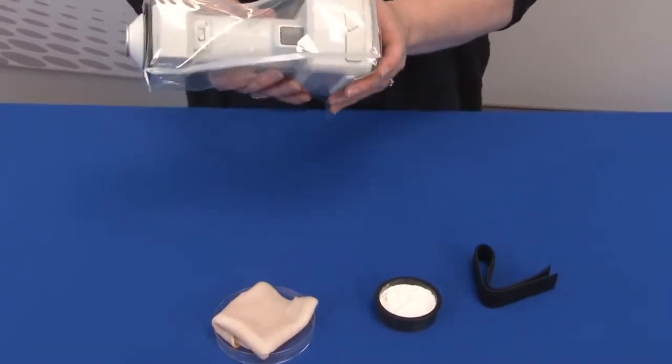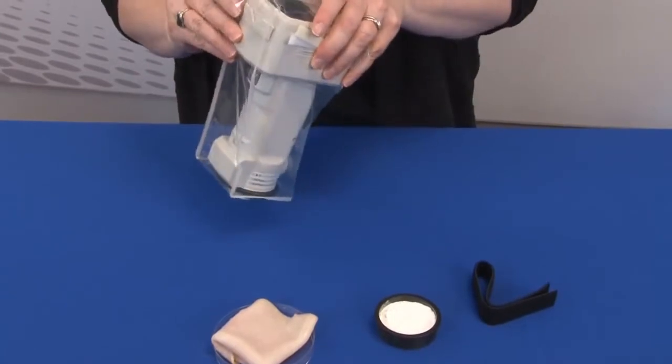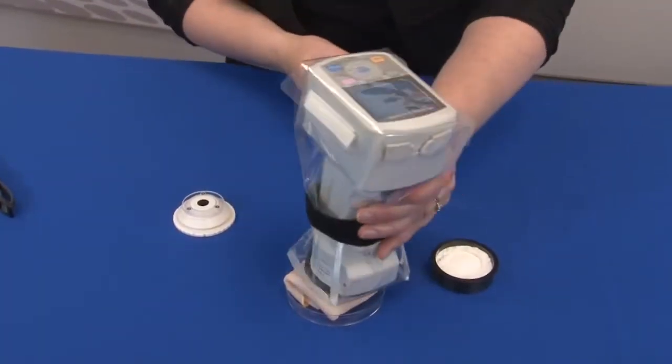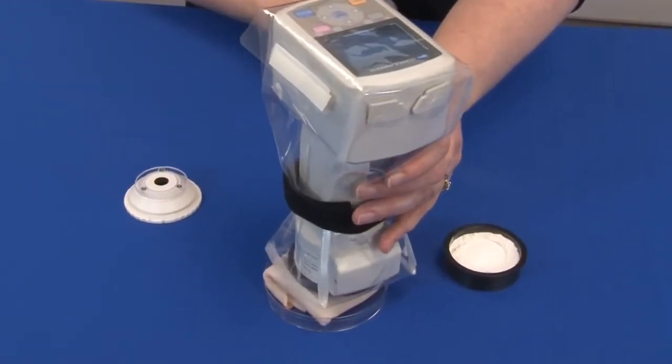After fastening around the instrument, the dust cover will protect foreign materials from getting inside the instrument. This will prevent inaccurate measurement readings and, if necessary, costly repairs.